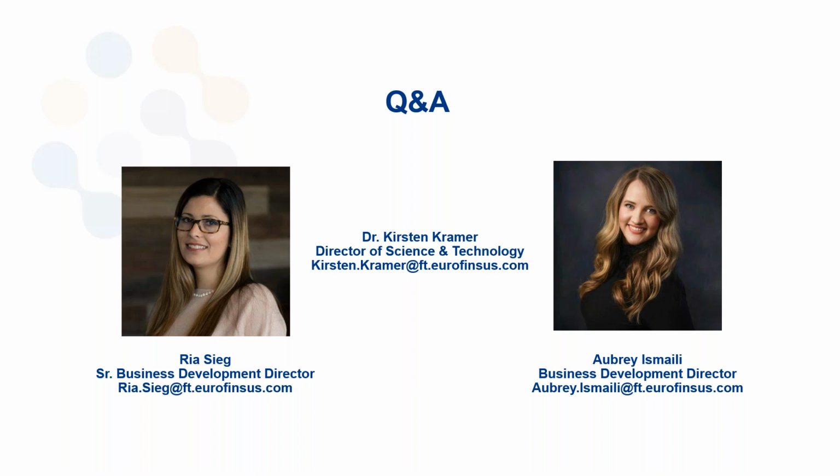All right, so the first question that we have, what do you guys do if there's a test we want that isn't listed? I can take that one. So we do what's called a feasibility study, and that means if we don't currently have a calibration built, we can just see if it's possible. So all we would need is the material that you are using and the parameters, and then we can do a study to see if IR can do the analysis. And we would have the correlation and the uncertainty and all of that information. And after the feasibility is performed, we would continue to build the model, validate it as needed.